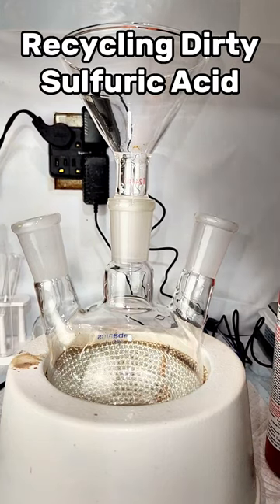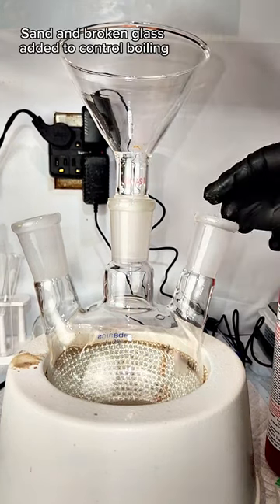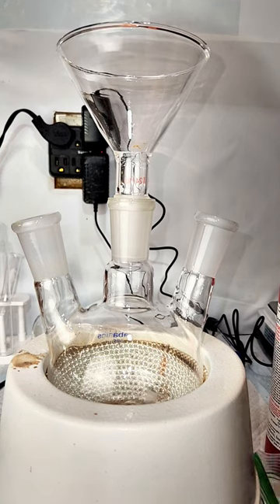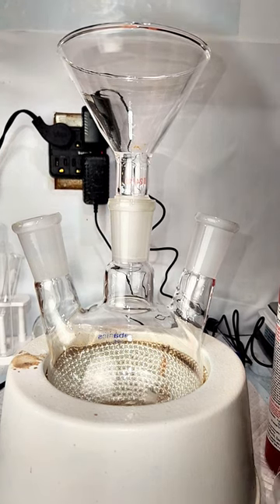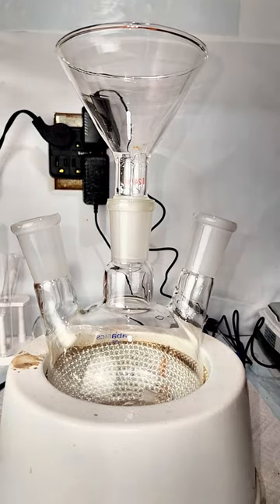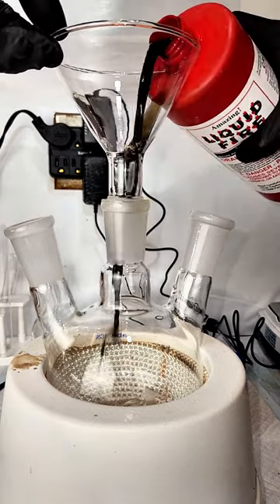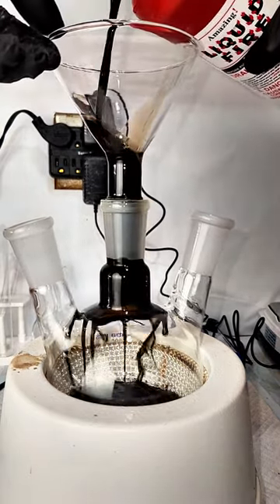I've gotten a lot of comments asking how I dispose of my spent sulfuric acid, specifically after dissolving something in piranha solution. I really enjoy chemical recovery, and I've never produced any inorganic waste that I haven't been able to repurpose. So today I'm going to show you how to recover and reuse really dirty sulfuric acid.